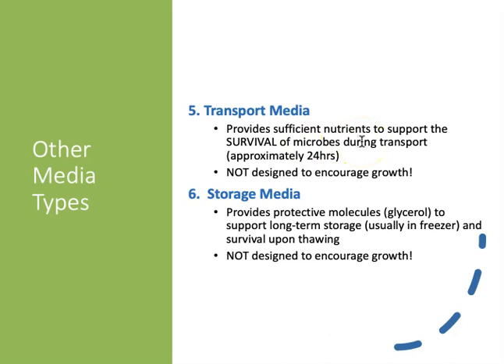Now, the important thing to know about transport media is that it is not designed to encourage growth. And if you think about how it's used, that makes sense. When a physician gathers a sample at the bedside of a patient and sends it off to the microbiology laboratory for analysis, the sample cannot simply be sent in any old container because the cells will die along the way. So instead, the sample is placed into some transport media.